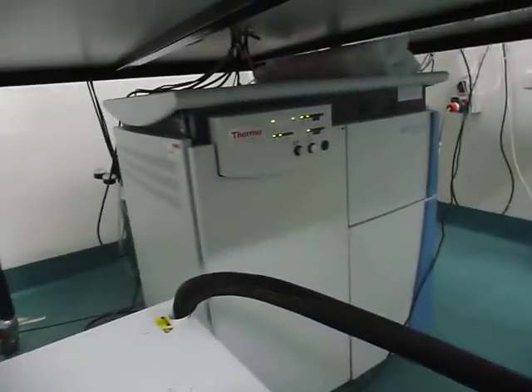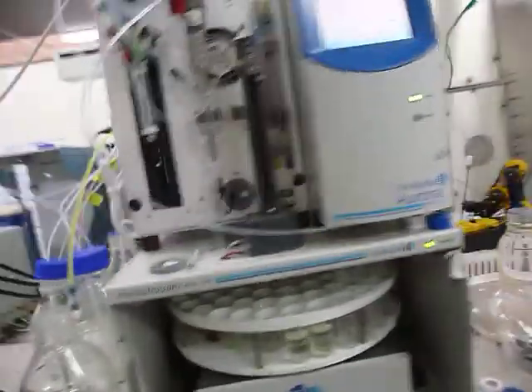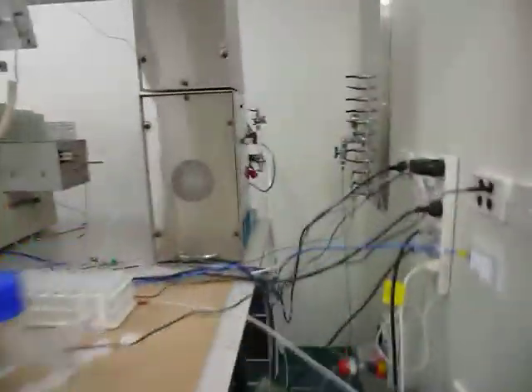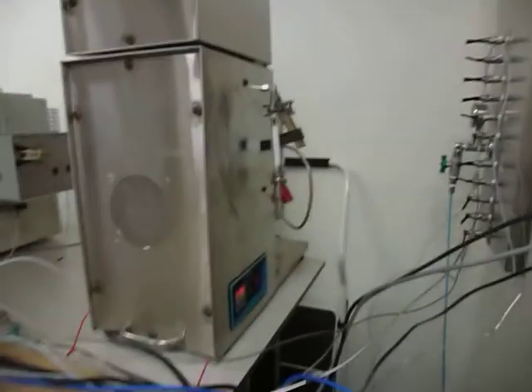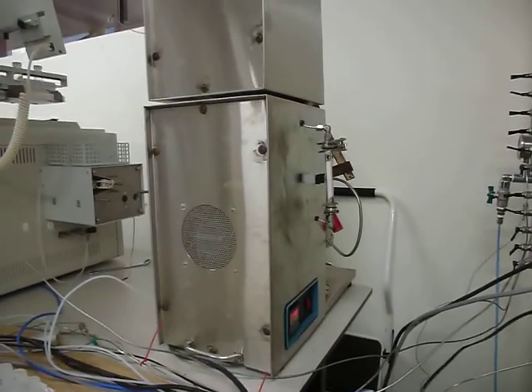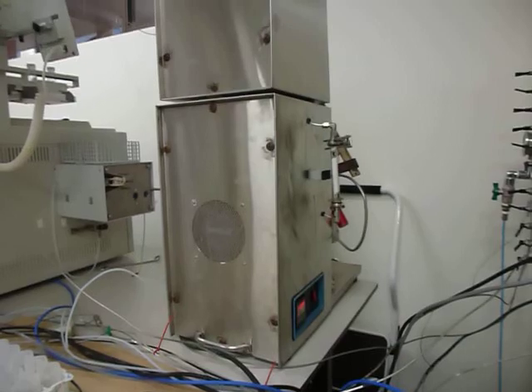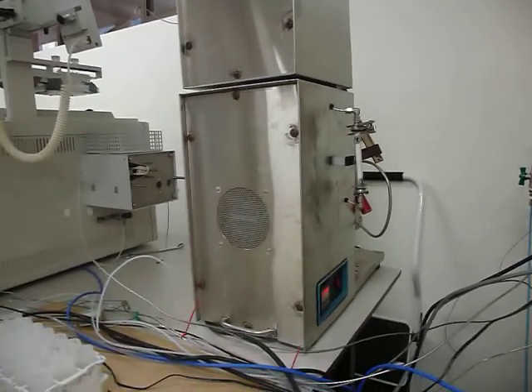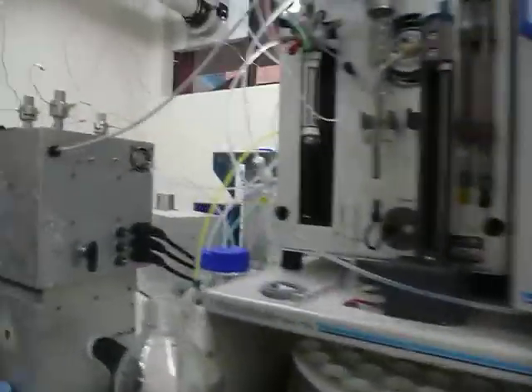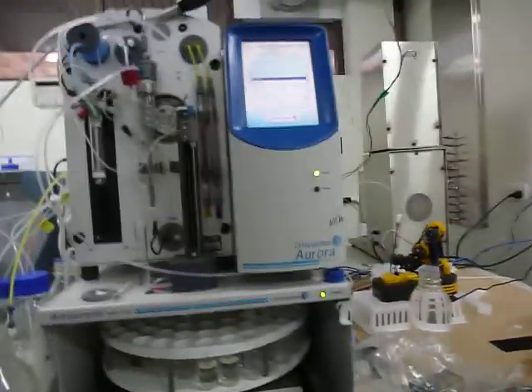Also there is the IRMS here. Some time ago a method was developed by some guys in Canada that allows the coupling of the TOC analyzer with the IRMS. There is this interface here in the middle that does some chemical reactions, but it's not controlled by the computer. There is just a furnace there at 700 degrees that helps some chemical reactions to happen.